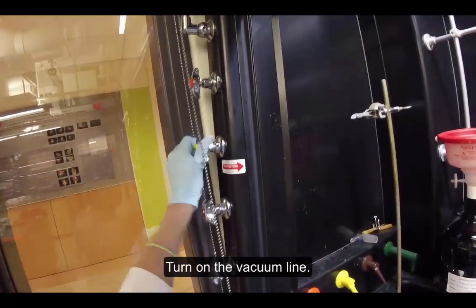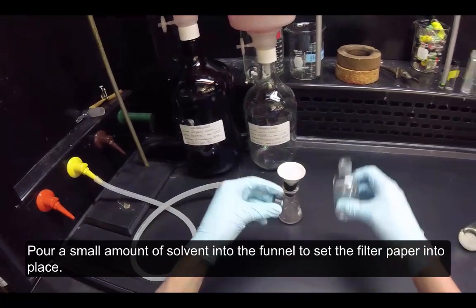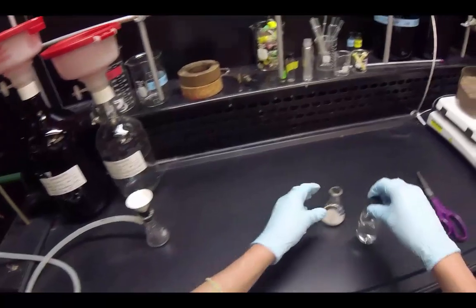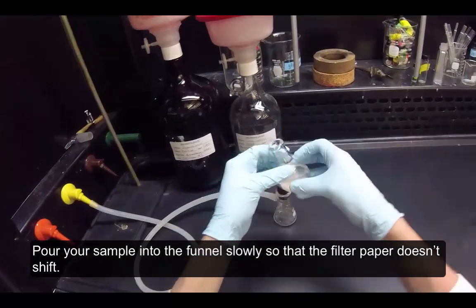Turn on the vacuum line. Pour a small amount of solvent into the funnel to set the filter paper into place. Pour your sample into the funnel slowly so that the filter paper doesn't shift.